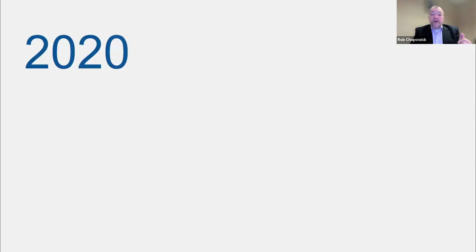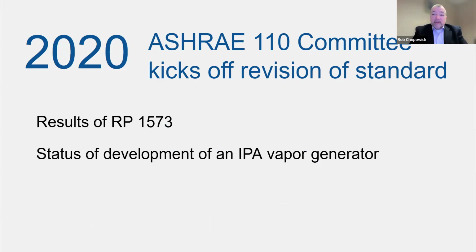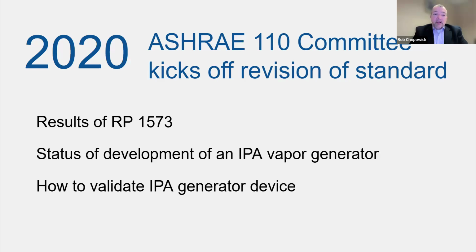So what do we do? Well, in 2020, the ASHRAE 110 committee began the journey to update the standard. We started by discussing the results of the research project. We talked about the need to develop a reliable vapor generating device for IPA. And we figured once a workable device was created, we needed to do some sort of testing. And we decided that we were going to do some round robin testing of this new device. And the big thing was the deadline for getting all this done was in 2024.